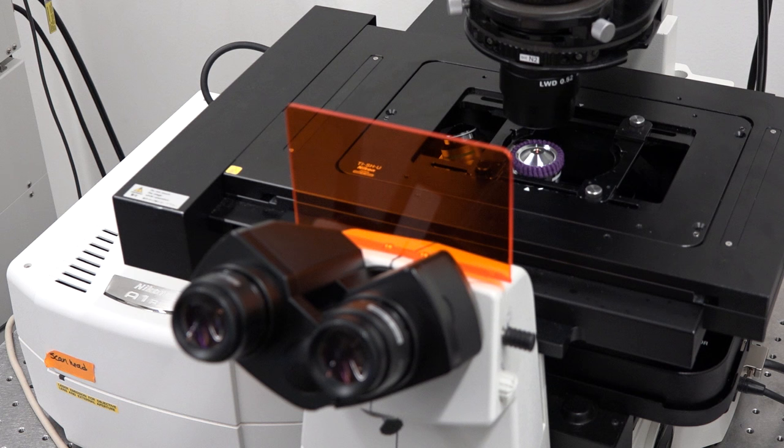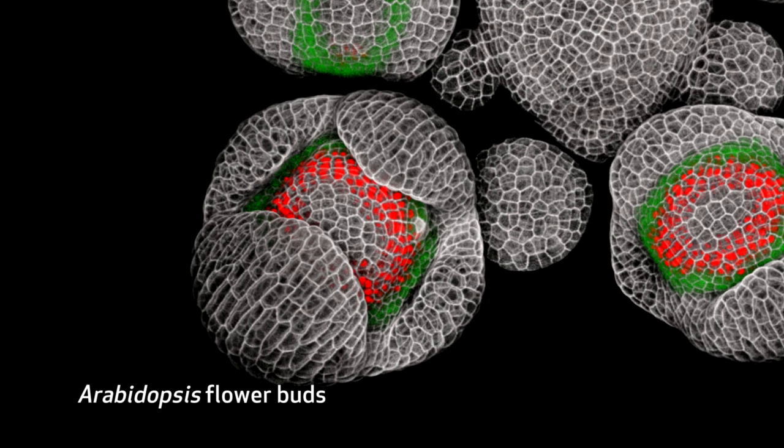This image that we see here is taken on a confocal microscope with a 40x lens. You see a red color, you see a green color. And what these colors represent are the expression patterns of different genes.